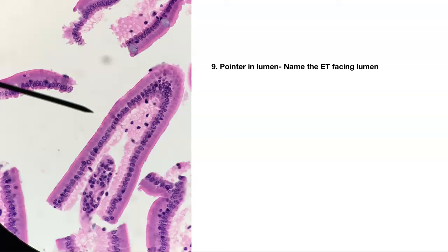Pointer is in the lumen. Name that epithelial tissue facing the lumen.